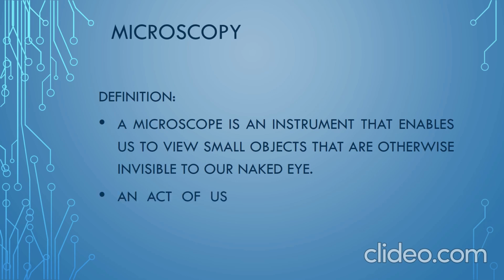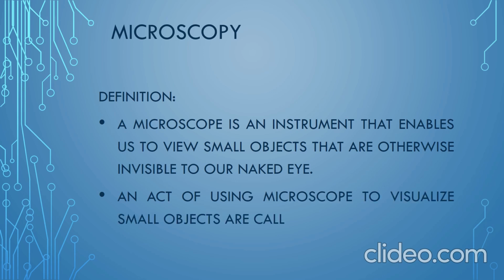Now we are supposed to know some introduction about the magnification power of the human eye and the sizes of different organisms, the microorganisms, which are not visualized by the naked eye. Naked eye means unaided eye, without any power, without any help. How we can see the microscopes, how we need.